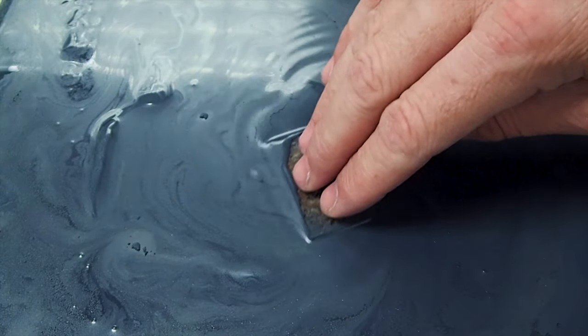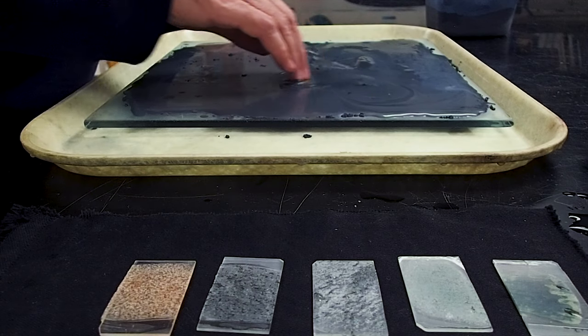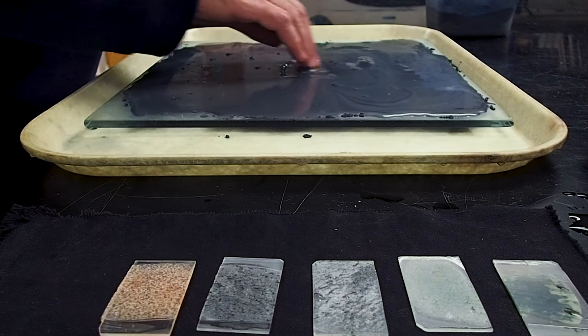Continue moving in small circles to grind the sample down more quickly, and up and down in a zigzag pattern for fine finishing. For our samples that have been prepared on the geoform, we won't worry about the fine finishing until we know we're approaching a thickness of 30 microns.